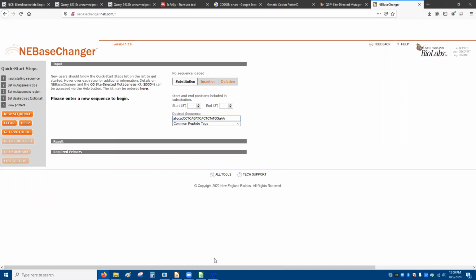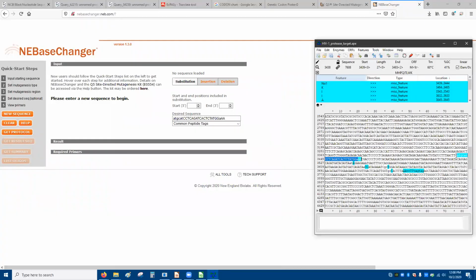And then we have to note where this is happening. This is an insertion. Theoretically, you would do one insertion for this cutting site, and you would do one substitution here with this lowercase a.